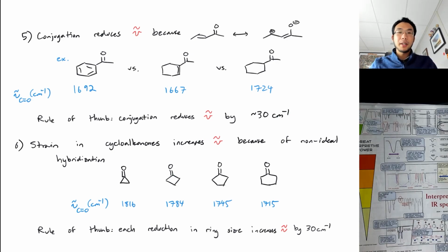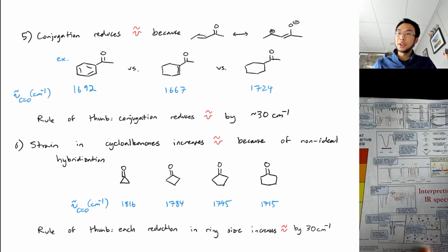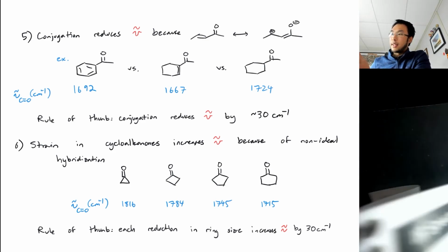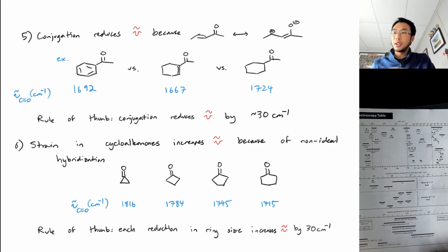As you're first learning about spectroscopy, and IR specifically, it can be very hard to keep track of all these numbers and exact locations where we expect to see things. So there are plenty of data tables that can be found that try to lay out where various functional groups will show up. This is one of them right here. This one's just a nice infographic version. And there is another one that I have here. This one is a more typical way for these data tables to show up.